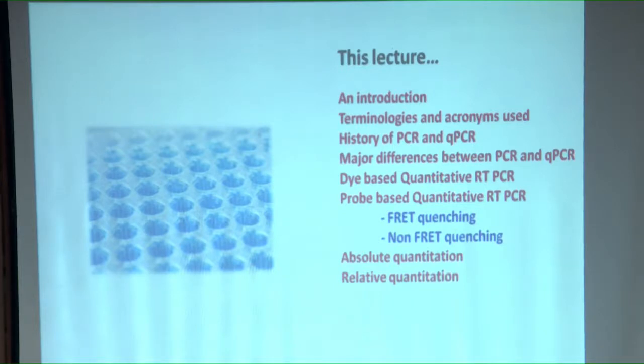You can use this technology to know how many genes, the plant genes, are affected. Affected means its normal expression is altered. It may be either way. Sometimes the genes are overexpressed, maybe to defend against the insects. Sometimes the genes are underexpressed, again to defend against the insects, maybe just by down-regulating some of the genes, so that at the end of the day the plant becomes non-palatable for the insects, primarily from the point of view of defense. So you can use this technology very elegantly in your research, what is called relative quantitation.